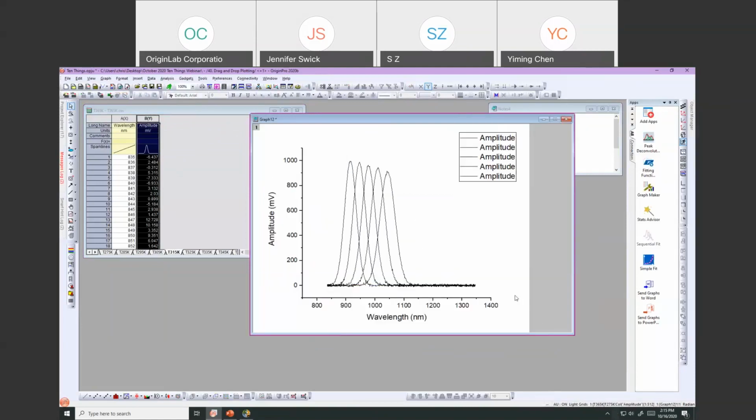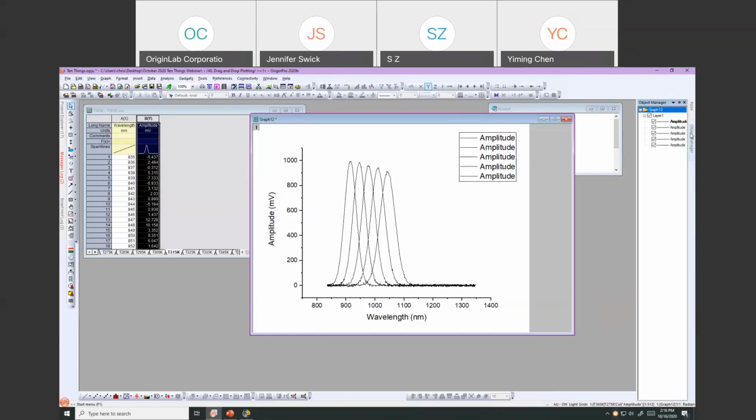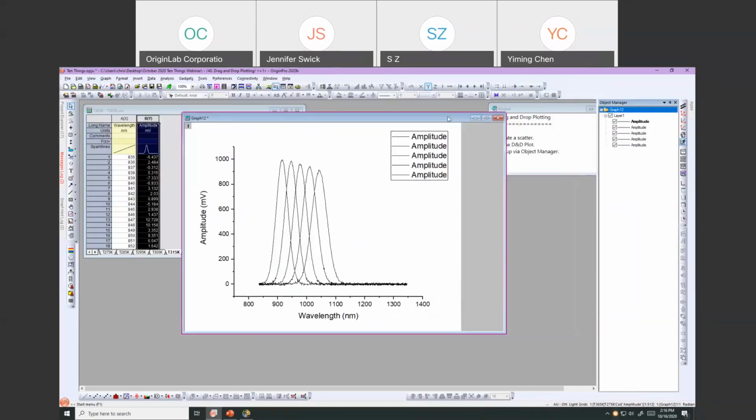We have another window on the right side of the Origin interface beside the apps window. I'm going to toggle that push button so our apps window closes. And the other window that's kind of over there that may be closed is the Object Manager. Let me select it, and again, I'm going to pin it open by clicking on that push pin. The Object Manager is a quick way to access properties of the graph. It also shows us that hierarchy that I've talked about in other webinars.